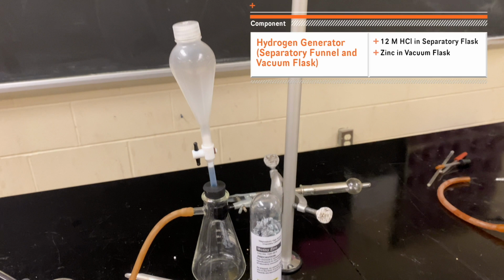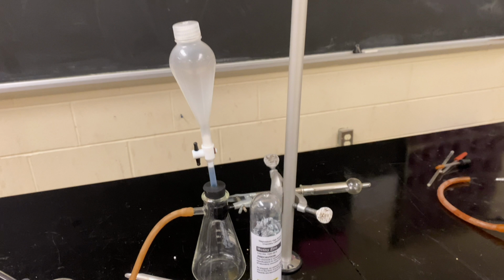This is the hydrogen generator. It's made of two components called a separatory funnel on top and a vacuum flask on the bottom. The separatory funnel is filled with the 12 molar hydrochloric acid, and the vacuum flask is filled with the zinc. A valve called a stopcock is released, which allows the hydrochloric acid to flow down into the zinc, creating the reaction. The reaction can be carefully controlled by adjusting the stopcock valve.